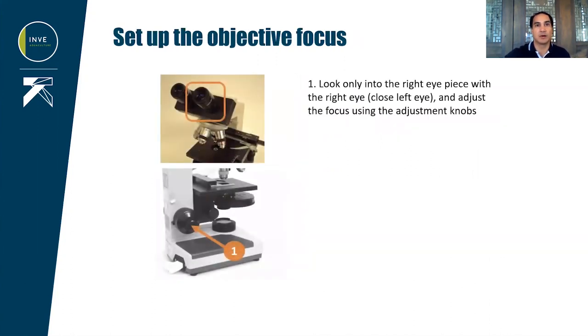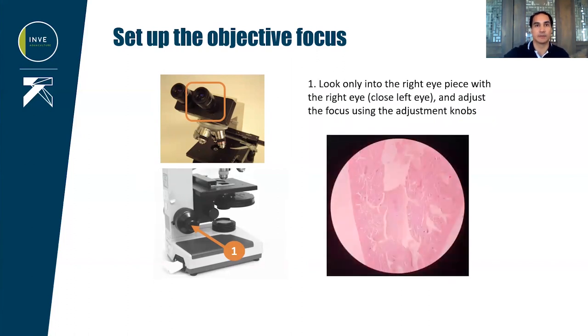We will now set up the objective. First, cover your left eye and look with the right eye into the right eyepiece, and adjust the focus using the adjustment knobs. When it's in focus, you should have a sharp image of your specimen.